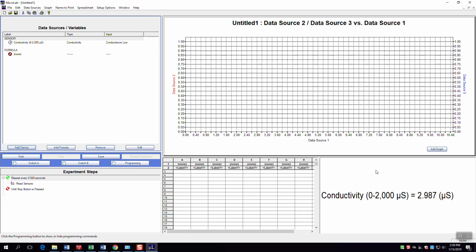This will happen forever. If you wait for a perfectly solid number that sticks around for a long time, you will never ever succeed. So when you see a number like this where it says 138 and it bounces around a little bit, it's safe to just say that your reading is 138 and write that down for your measurement. We don't really need the 7 different sig figs that we have available to us.